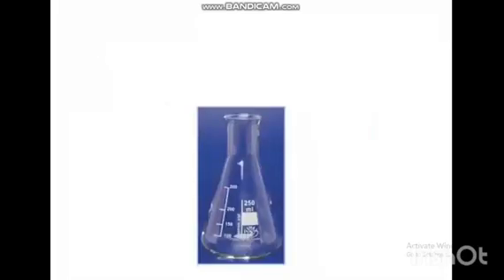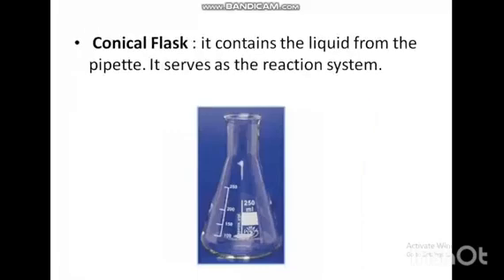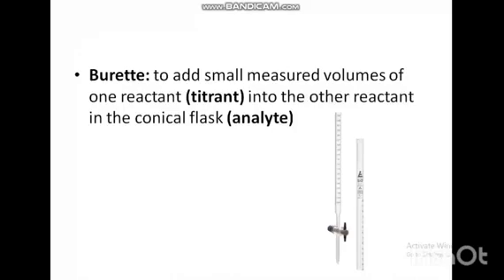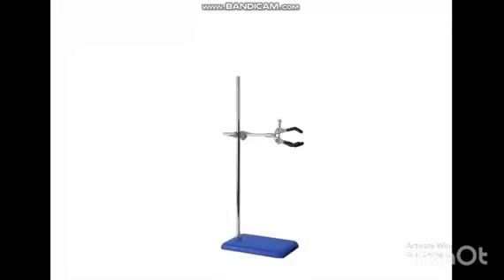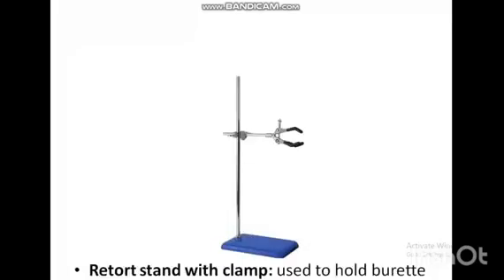This is conical flask. It contains the liquid from the pipettes. It serves as the reaction system. This is burette, to add small measured volumes of one reactant into the other reactants in the conical flask. This is retort stand, used to hold burette.